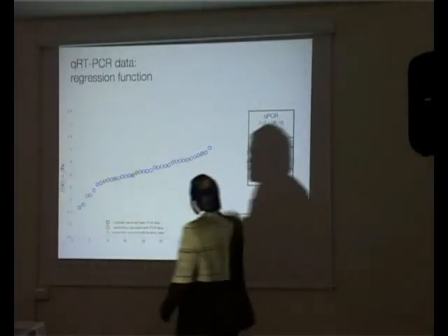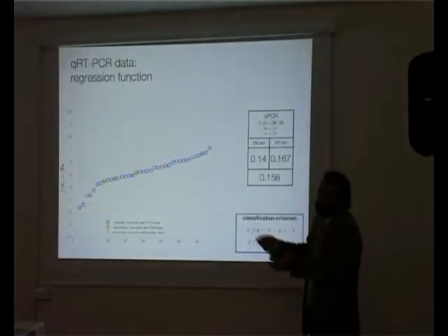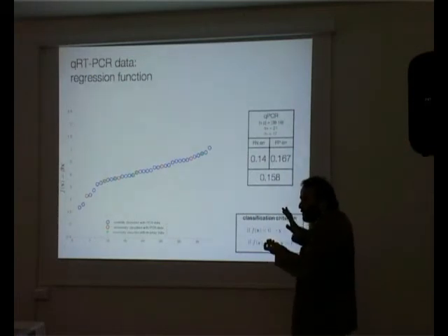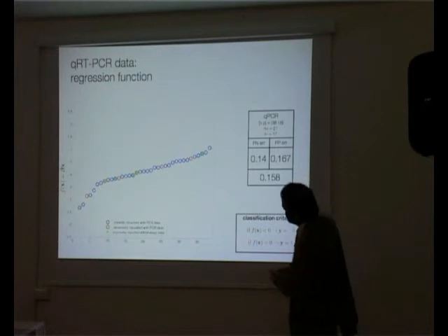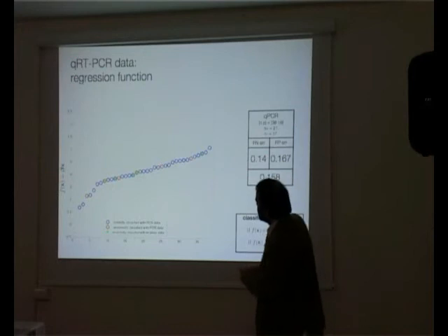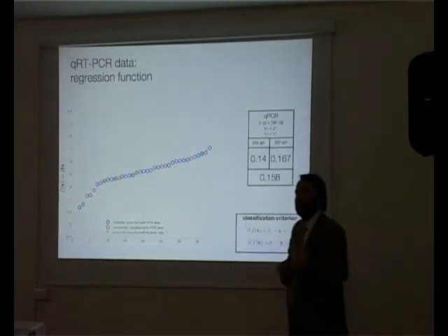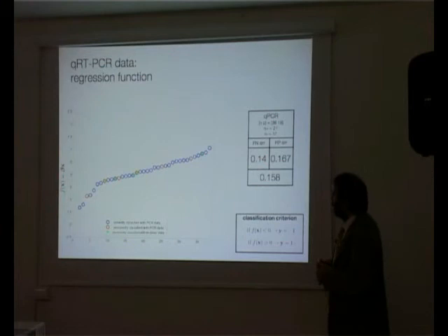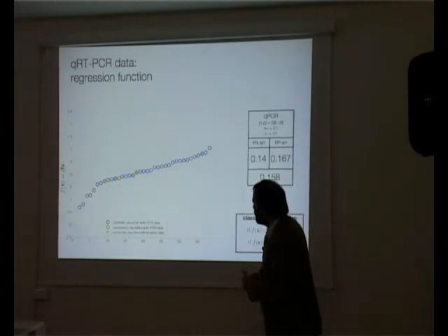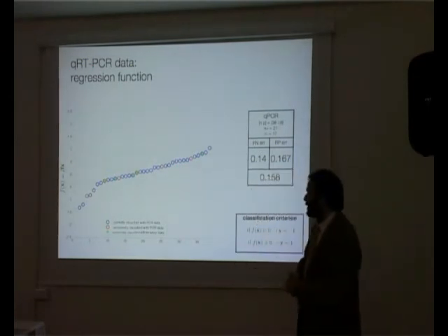So now what you see in blue is good news. I mean, the test is correct. Of course, we hide the label first, and then we check, and there is no leak in the procedure. Now, what you see in red is what is missed by the real-time PCR. What you see in green were the original errors we made, and whatever is blue and green means that it is now correctly classified, but previously was incorrectly classified.